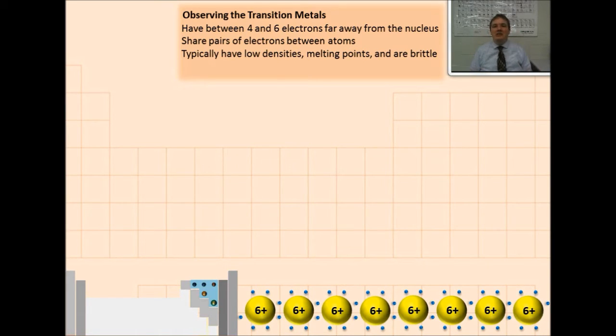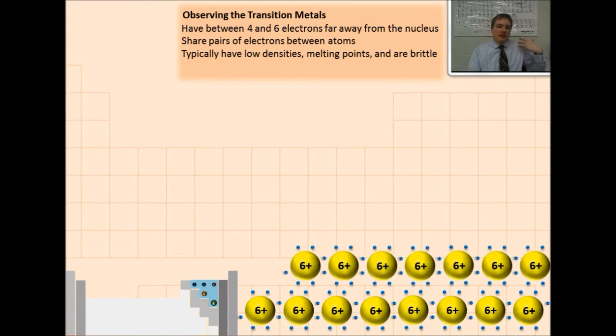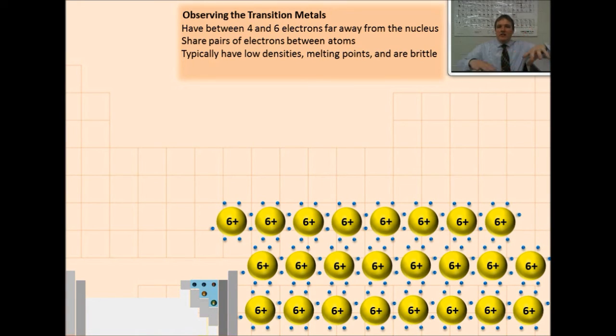Sulfur is actually able to make a polymer element. And when it does that, the long lines of sulfur atoms get twisted around each other. It makes a very plasticky, flexible type of substance. It's actually called plastic sulfur.